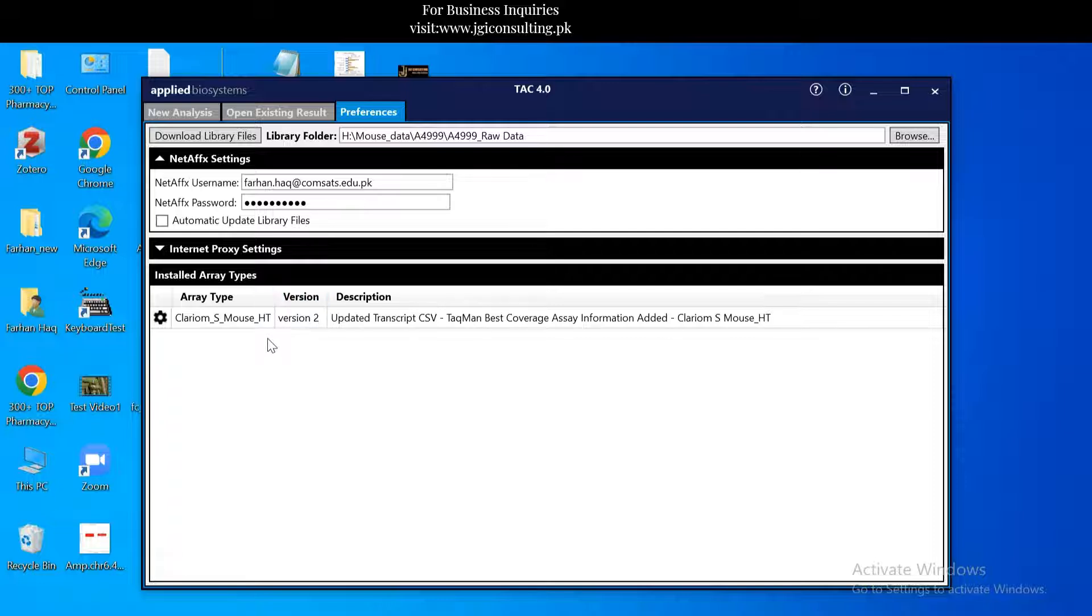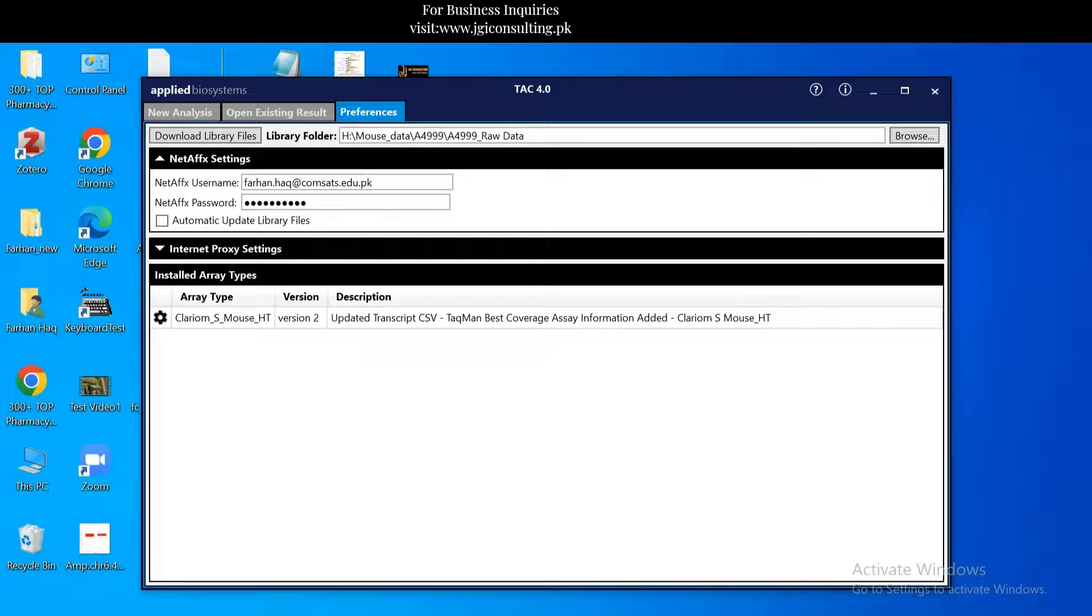Preferences - you need to log in first with NetAffx ID.